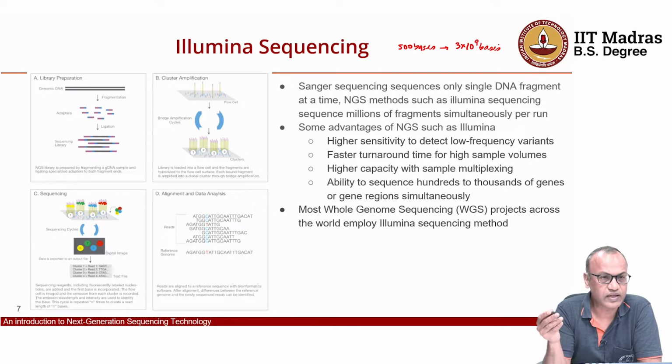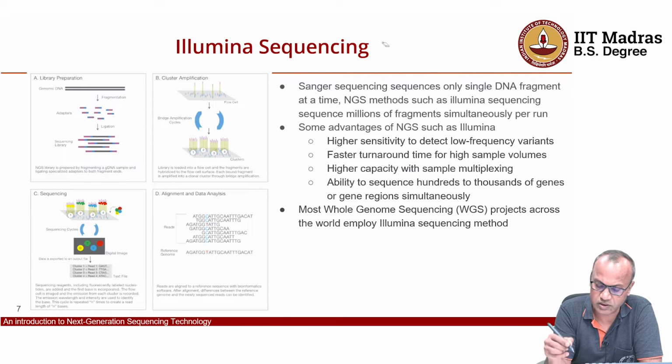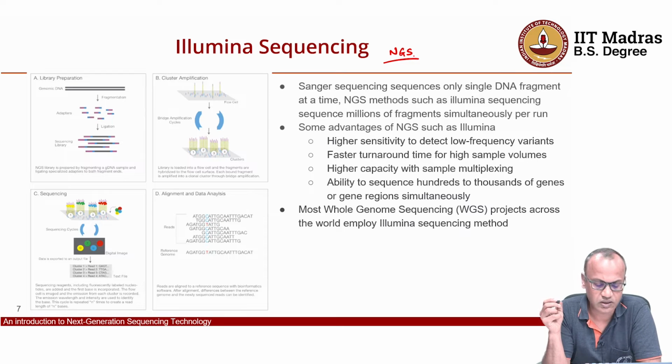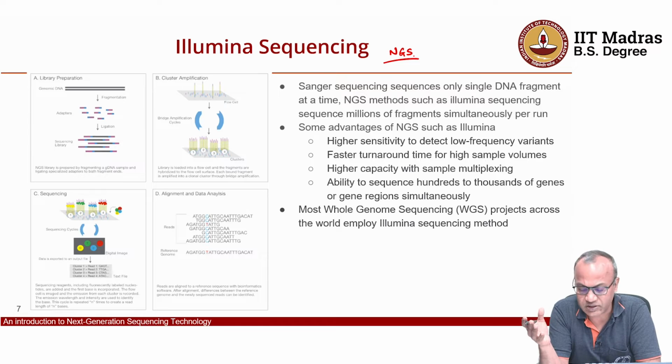Given that fact, these next generation sequencing technologies, these are called NGS, came about almost a decade ago and revolutionized the way we sequence DNA. It not only revolutionized the way we sequence DNA, it also revolutionized what all different new technologies can be developed based on the next generation sequencing platform.